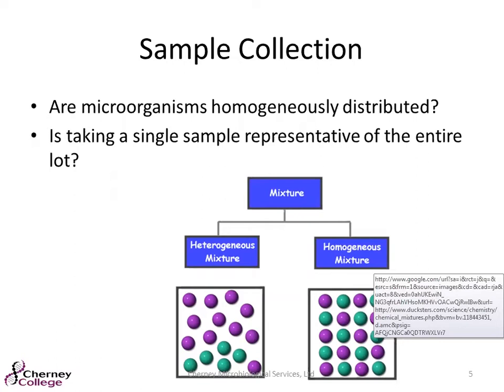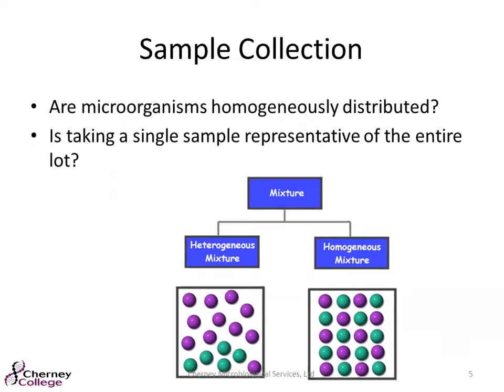And obviously you can't test 100% of your product. There's time involved, there's a lot of money involved. So when you do get that sample, try to take a representative sample. And that's where really following all procedures, all steps, no shortcuts, helps you get to that good result and hopefully find it if it is there.